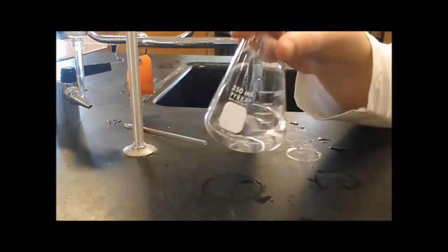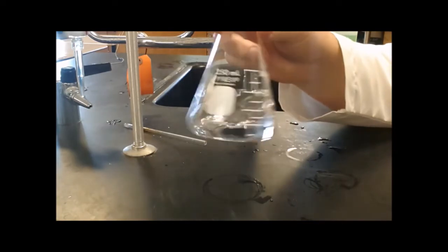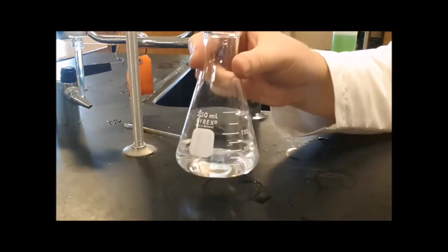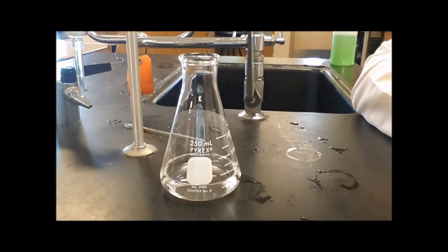Notice that the phenolphthalein didn't change the color of my acid solution. That's because phenolphthalein detects the presence of hydroxide ions. It detects the presence of a base. It doesn't detect the presence of acids. So it will change colors when there are just a tiny bit more moles of base than there are moles of acid. At that point, we'll know we've reached the endpoint of the titration.